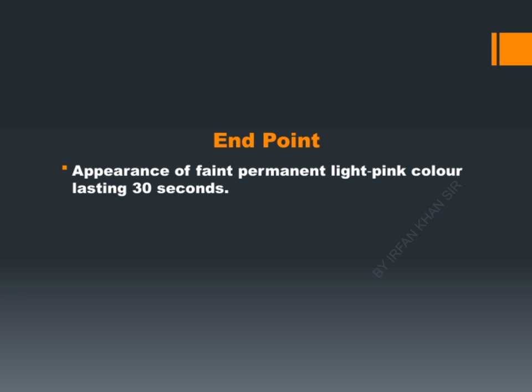Recognizing this pink coloration is important because it confirms that the process has successfully progressed to this stage, and it allows us to make informed decisions about the next steps. Remember, this faint pink color is a key endpoint marker, ensuring we're on the right track in our overall procedure.